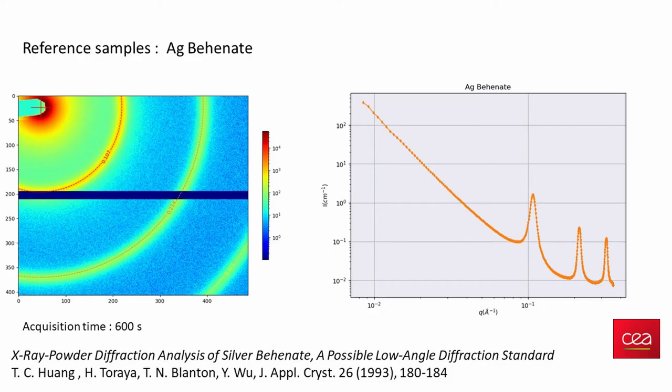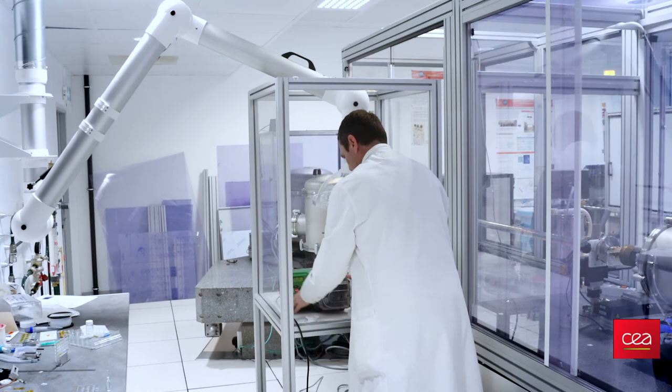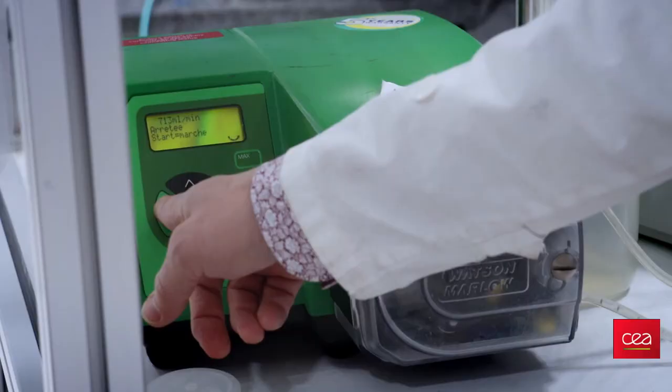This homemade small-angle X-ray scattering laboratory instrument enables us to start a SAXS characterization very quickly after the end of the synthesis. It's also designed to study the evolution of a chemical reaction in real time with a chemical benchtop beside the SAXS instrument.